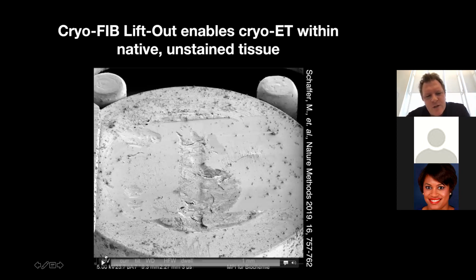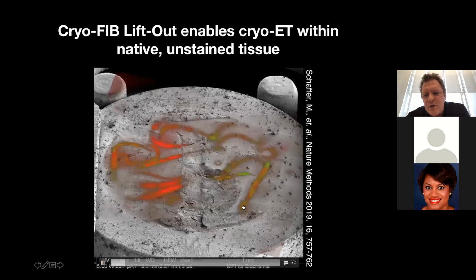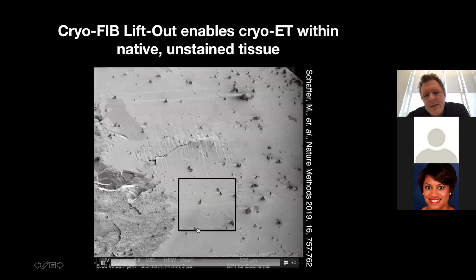The only challenge is that when you freeze the organism, it's a much bigger block because here we have C. elegans buried in the ice, and we have to identify them, as you can see, because we can't see them currently, using fluorescence microscopy first. So you start to see the GFP tagged C. elegans.